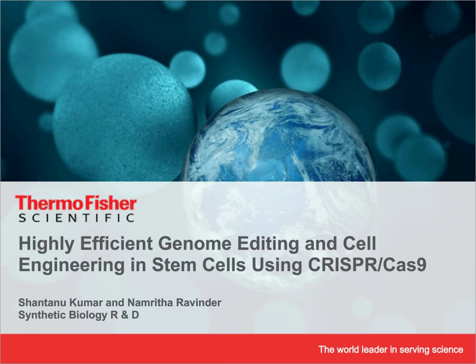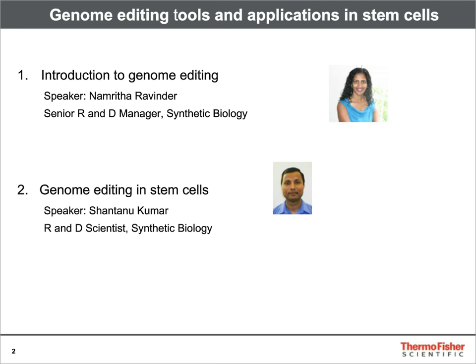Today, Shantanu and myself from the Synthetic Biology R&D team at Thermo Fisher Scientific will share with you highly efficient genome editing and cell engineering applications in stem cells using CRISPR-Cas9. Today's topic will be divided into two parts. I will first walk you through the different genome editing technologies and give you a little background, and then focus more on the CRISPR-Cas9 system, and give you more details on the latest developments that we have done in this area. Following which, Shantanu will cover application data in stem cells.